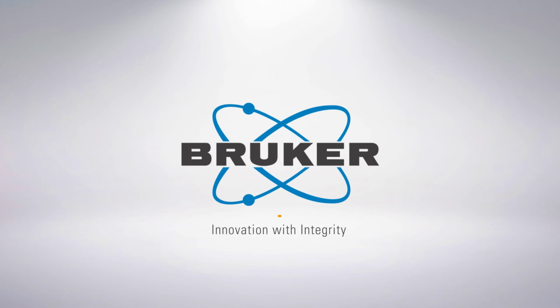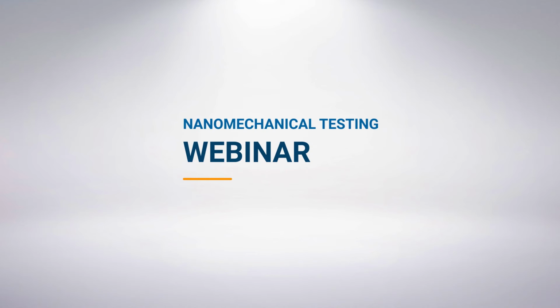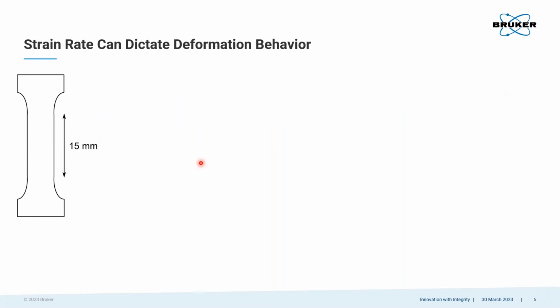So today I'll be presenting my algorithms for nanoindentation strain rate jump tests. And I'll get started by discussing why we care about the strain rate dependence of materials.